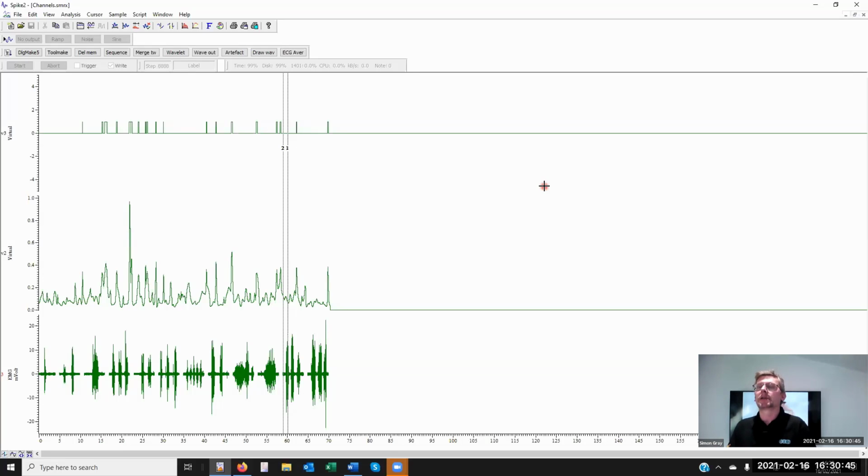Now let's argue that that's taken about 20 milliseconds to arrive. We've then got to initiate the call to the virtual channel to then take the data that's appeared in the file and draw it, calculate the new values as required by the virtual channel expression. We could then use an active cursor or a script to detect, does the virtual channel go above a level?